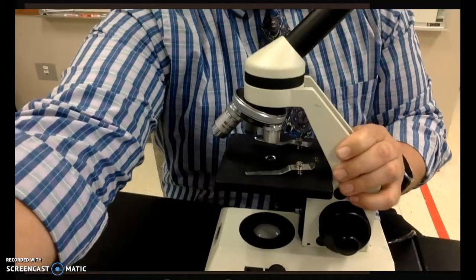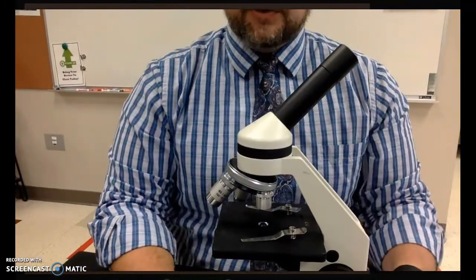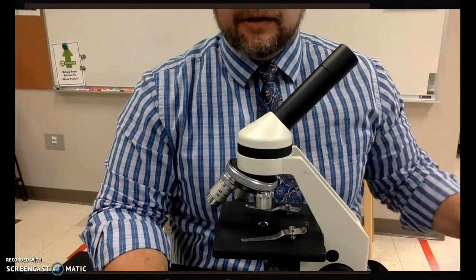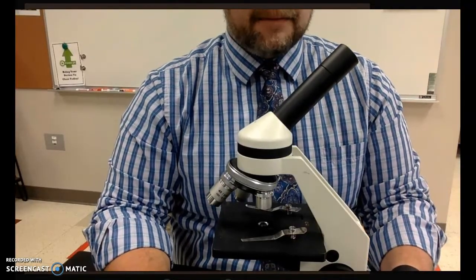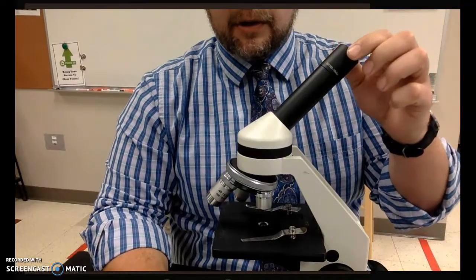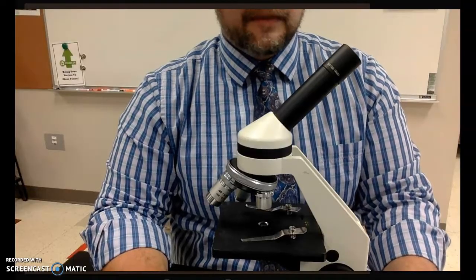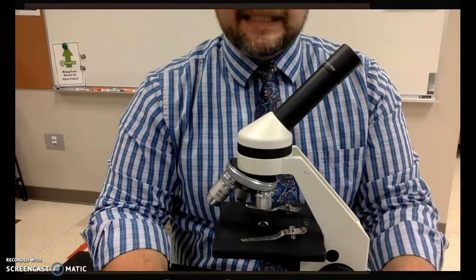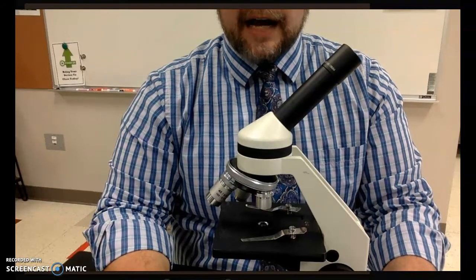here is a microscope. I'm going to go through the different parts of the microscope so you can become familiar with them. As I am describing the parts of the microscope, please fill out your diagram. Starting on the top of the microscope, we have what is called the eyepiece, also sometimes called the ocular lens. The microscopes which we have in our class all have an eyepiece with magnification of 10x. That means that magnification is 10 times what the eye can see on its own.